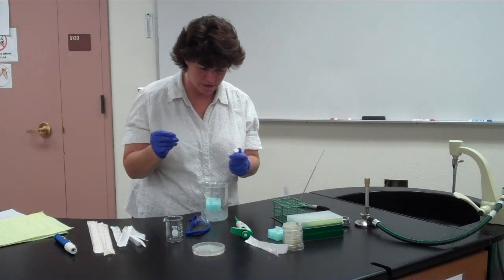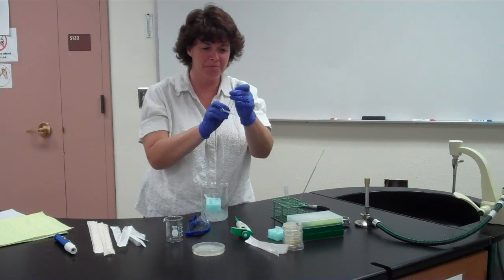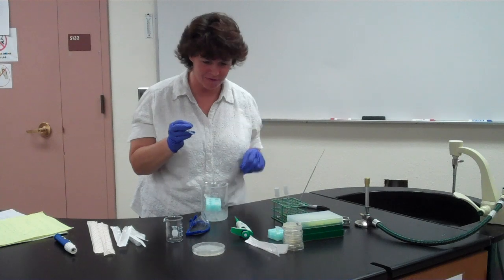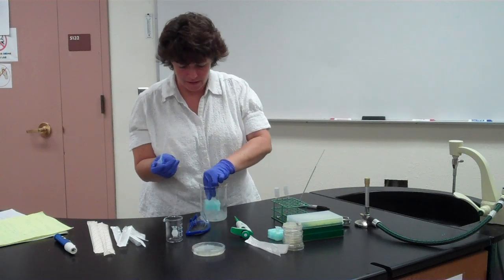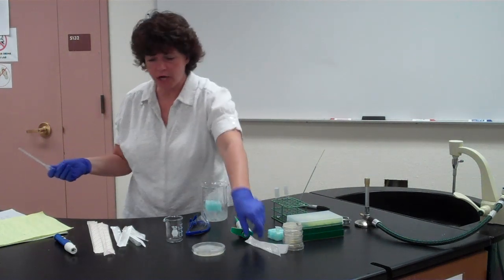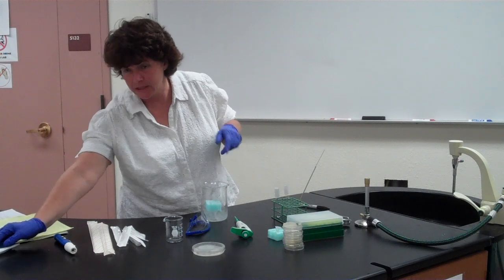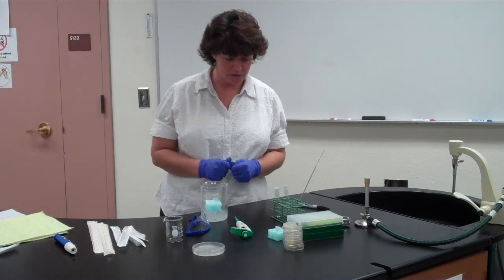And probably don't need to do the sterile technique we've done in the past. Well, we do need to use sterile technique, but we could probably take the lid off without lifting it. Okay, so that's my 250 microliters of my calcium chloride. We're not going to use this pipette anymore, so we would throw it in the trash. It doesn't have any bacteria on it, so there's no need to put it in any type of biohazard container.